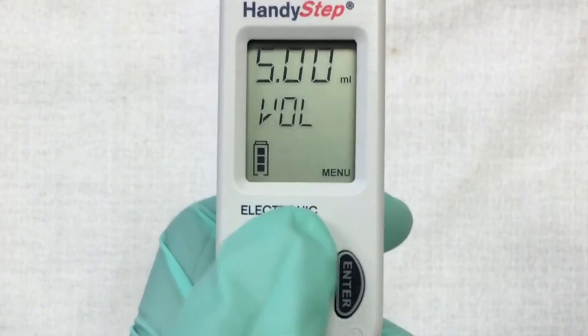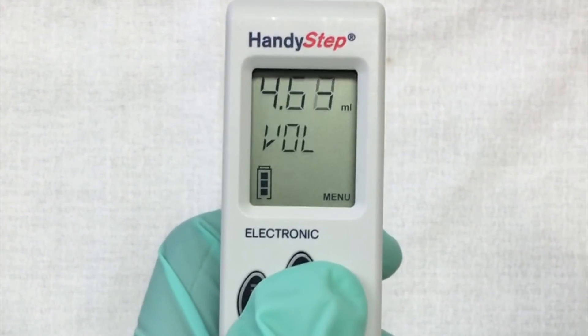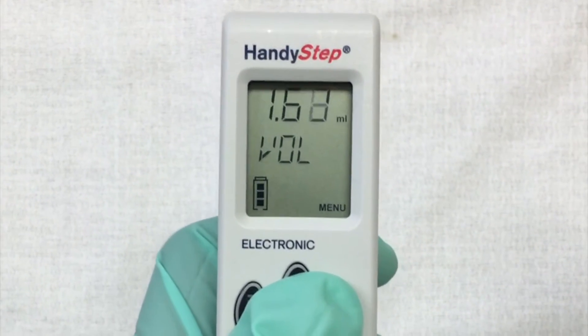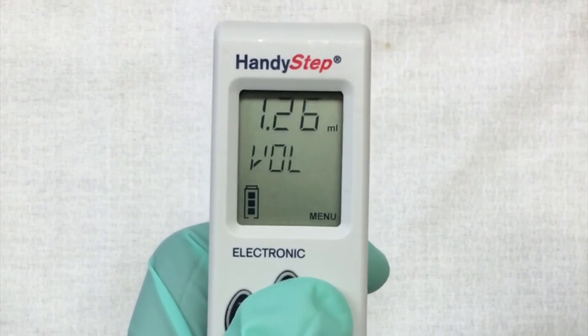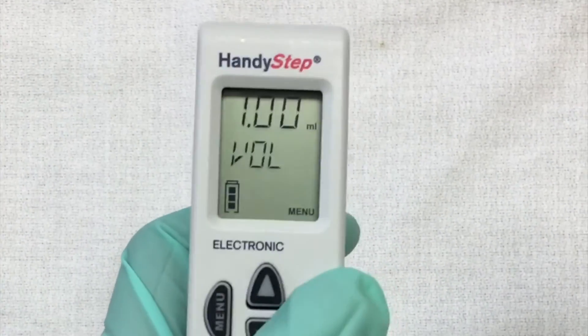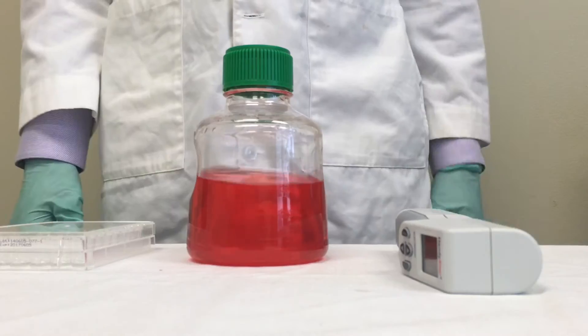The top number shows the volume you want to dispense. Underneath that number is the number of steps you can dispense at that volume. To adjust the volume, hit the menu button and use the arrows to adjust the volume. We are going to set ours to 1 milliliter. When you are finished finding your volume, hit the enter button to save it.